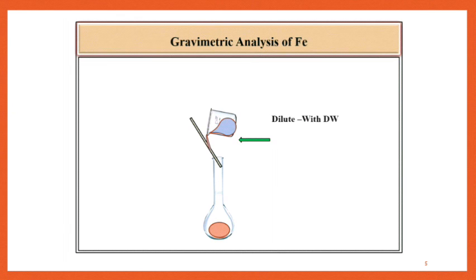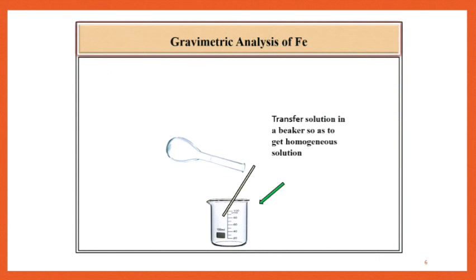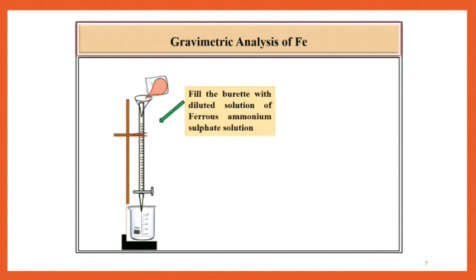Dilute this solution by using distilled water up to the mark and now transfer this diluted solution in a clean and dry beaker to get the homogenous solution. Then fill the burette with this diluted solution of Ferrous ammonium sulphate.